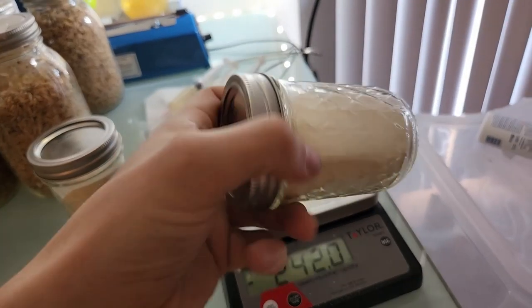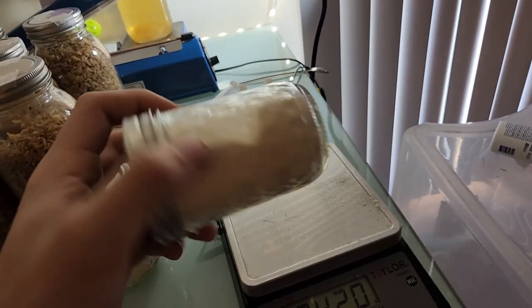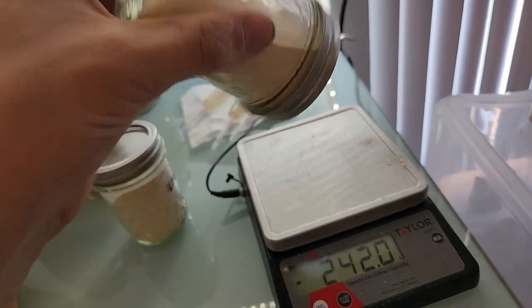I like to roll it in all directions. I like to vigorously shake it, and I'll do this for at least a couple minutes to make sure it's nice and homogenized.